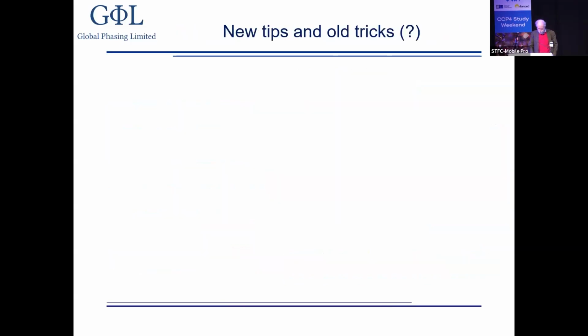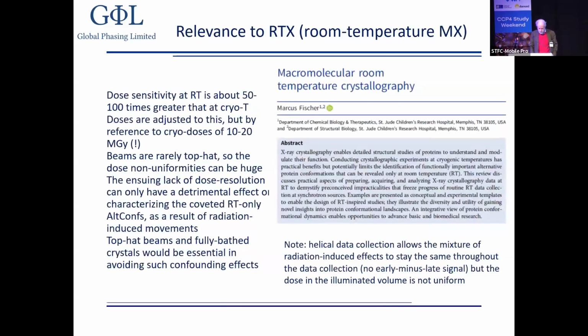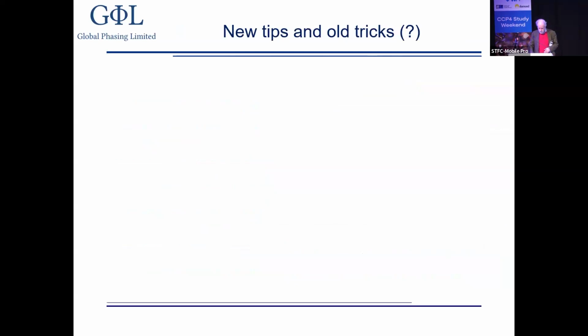Okay, so this is what I wanted to present under this heading of dose resolution. There's a lot to analyze there because probably what we end up seeing as B factors, if we fine slice the dose in these ideal experimental conditions, we would probably be able to ascribe, at least in part, to these actual motions. So there is motion, just like on a cryo-EM grid. We have to do some motion correction at some stage, and we may see more than we see in the end.